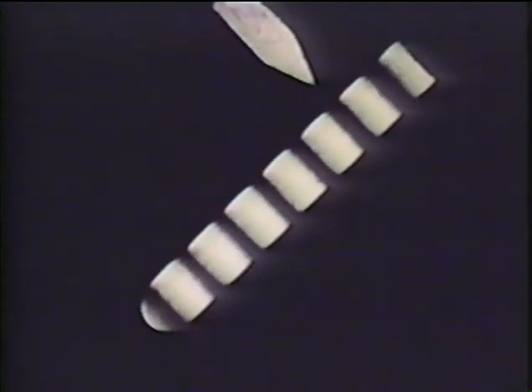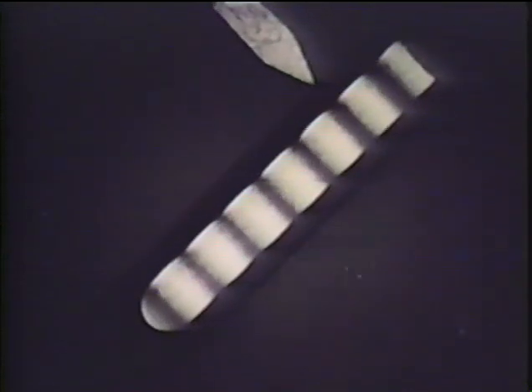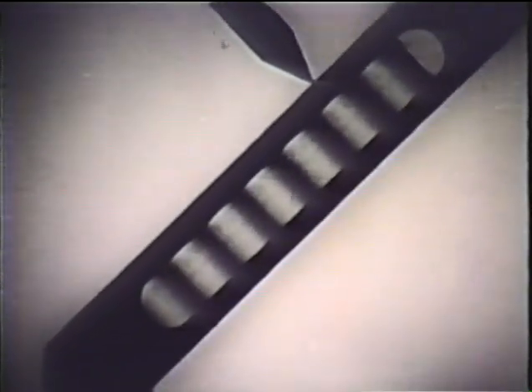Again, if we turn the polarizer to the parallel position, another set of black bands is seen. This time, they mark retardations equal to half a wavelength and then one and a half, two and a half, and so on.